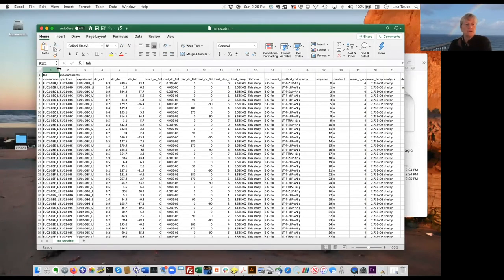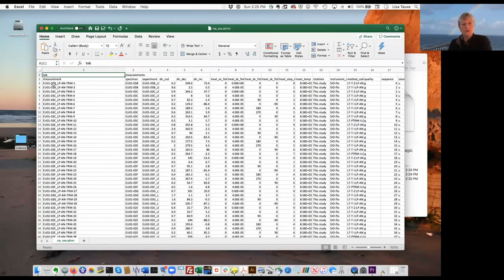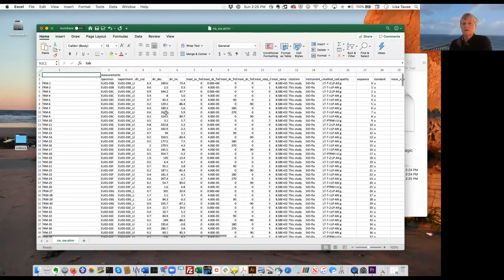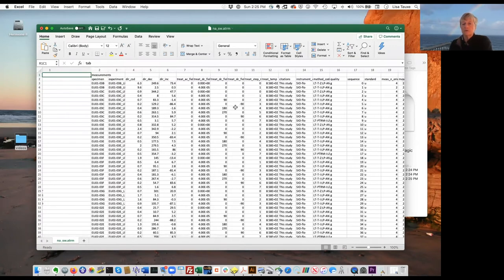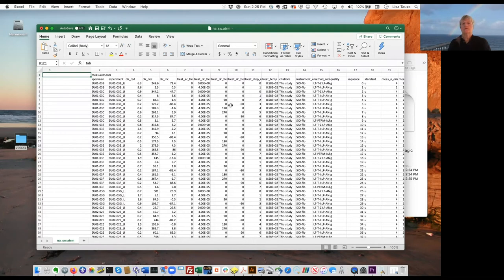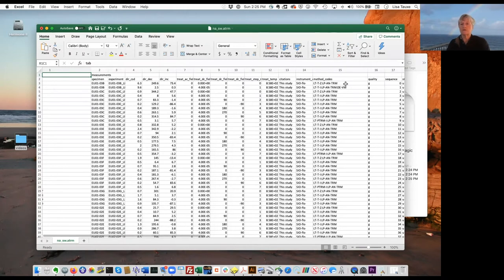Taking a quick look at the ATRM magic file, you can see this is part of an anisotropy of TRM experiment. You can see the lab field treatment steps — the field directions for each sample. The method code tells us this is an anisotropy of TRM experiment.